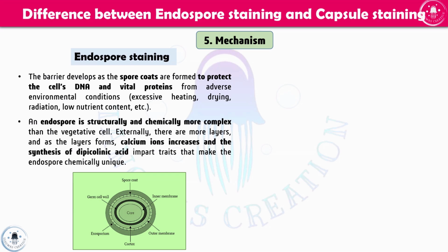Okay, so this is the reason behind the resistant nature of this endospore, and this makes the endospore staining usable. Only endospore staining is used for this purpose, otherwise other stains are not applicable to stain this endospore. Okay, so this is the reason for the endospore staining.